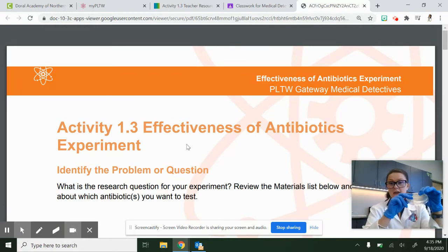Then you're going to have a Petri dish, which we should all be familiar with now because we did a little pre-bacteria lab. And remember that the bottom part is the part that actually has the agar on it, and then the top part is the part that has the lid, and it sort of overlaps that bottom part. So what you're going to want to do is you'll have a sterile Q-tip, and one partner is going to do this, and then I'll show you what the other partner is going to do next.